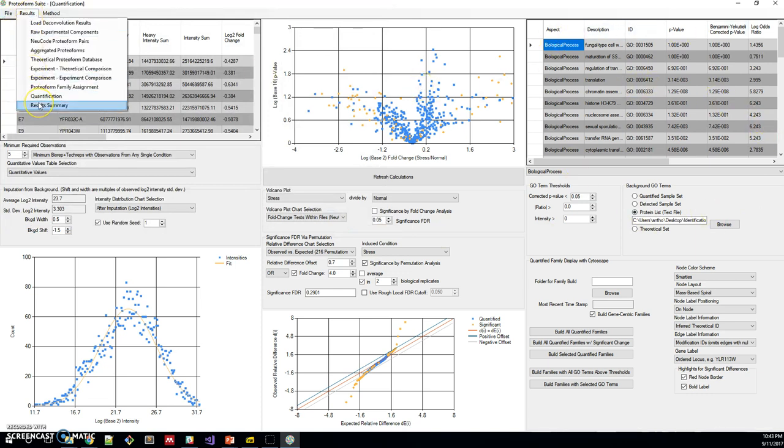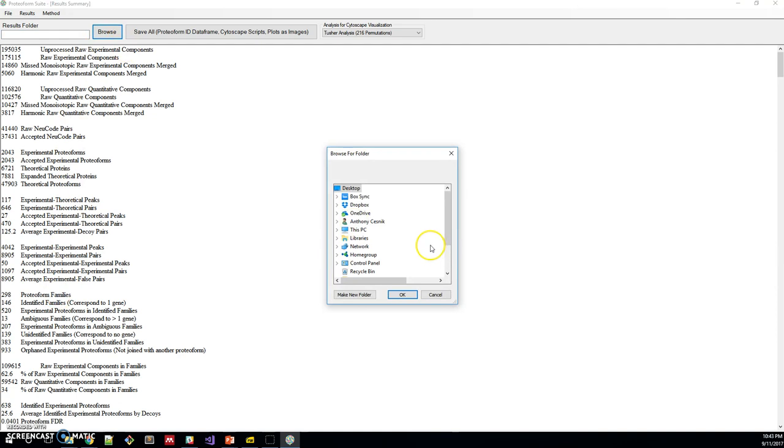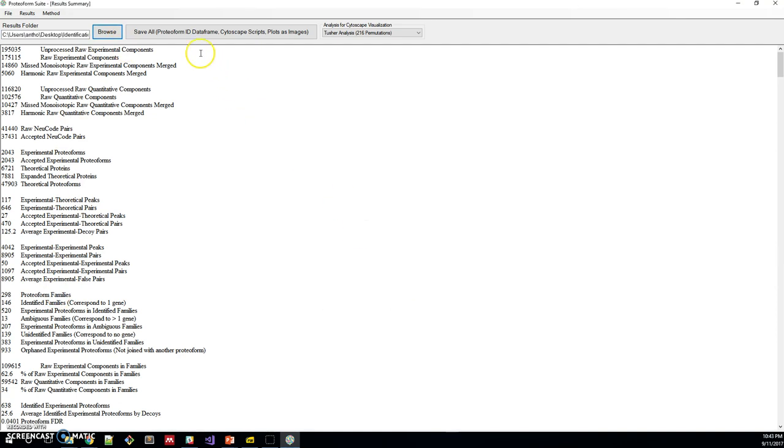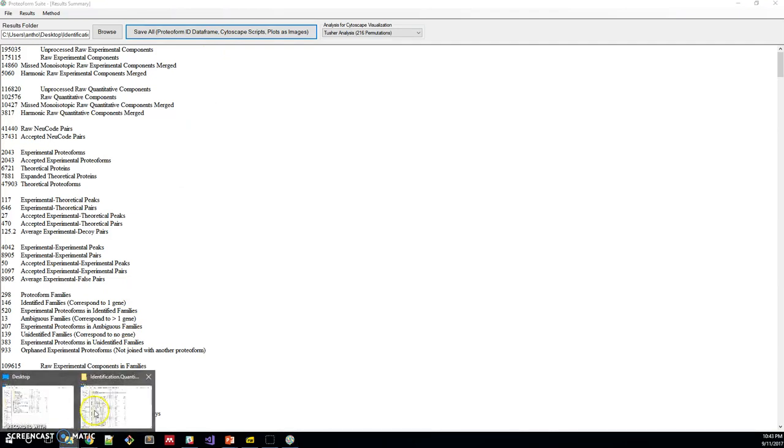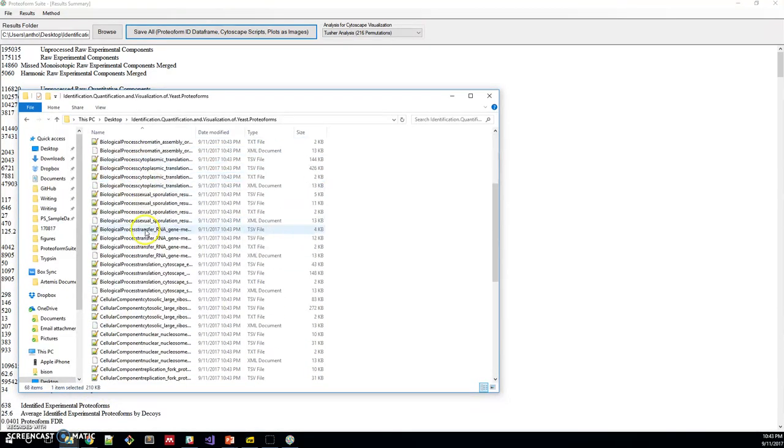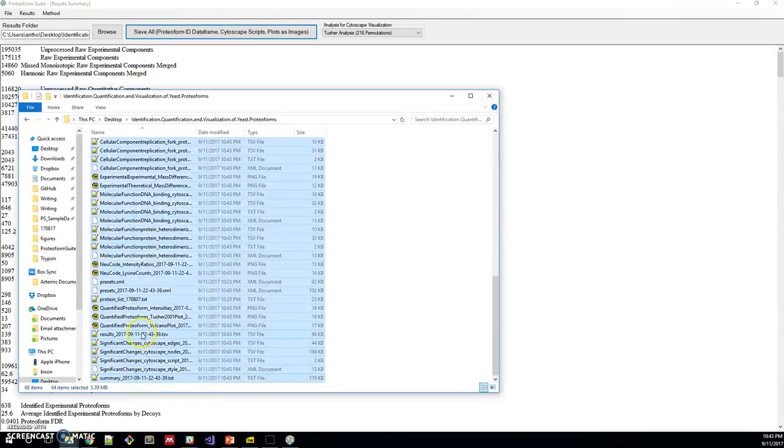Lastly, we have the results summary. Here we have all the results that we've gone through so far and we can save them to a folder of our choice. I'll choose the vignette folder and we can click save all. It'll take a few seconds. And now it's done. We can take a look and now all of these, there are lots of results that I'll talk about in other videos.